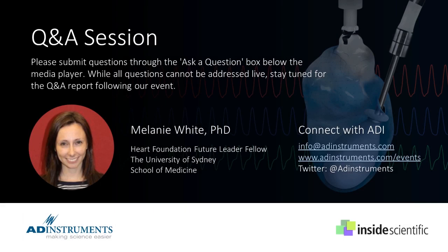So our first question today comes from Juan Carlos, who asked, does the study of isolated heart remain a valid method to study coronary vascular reactivity? And what are the advantages of this method of experimental study?